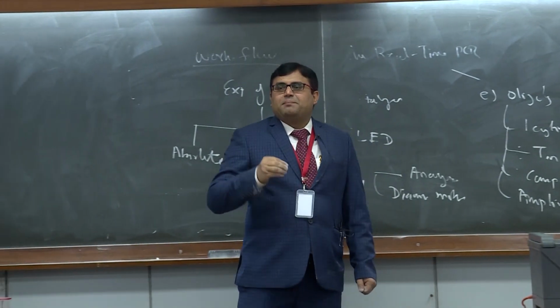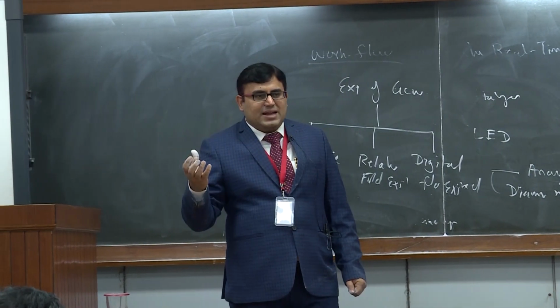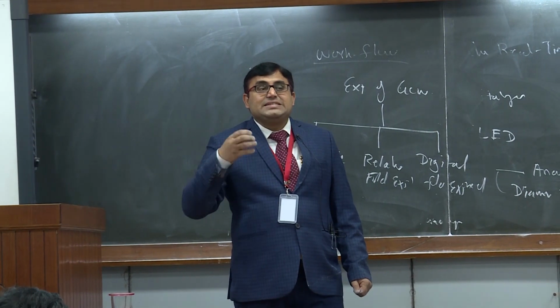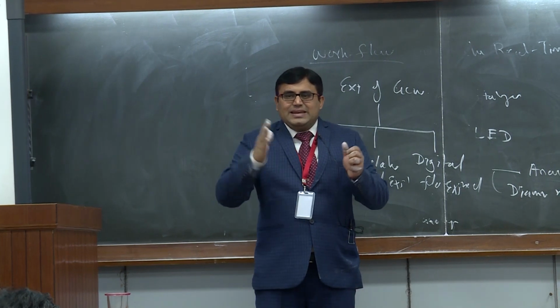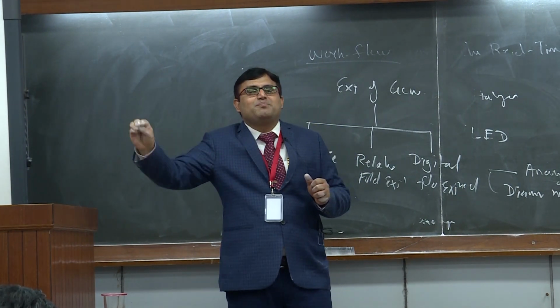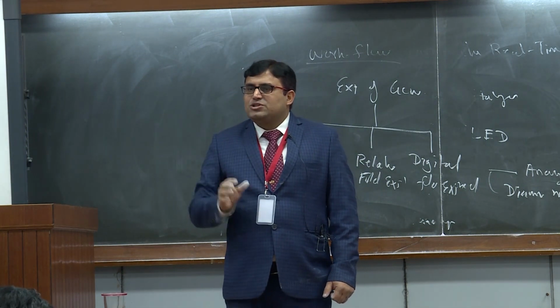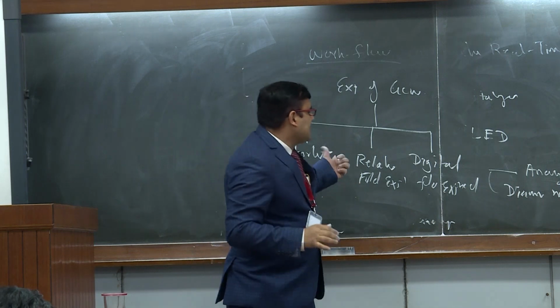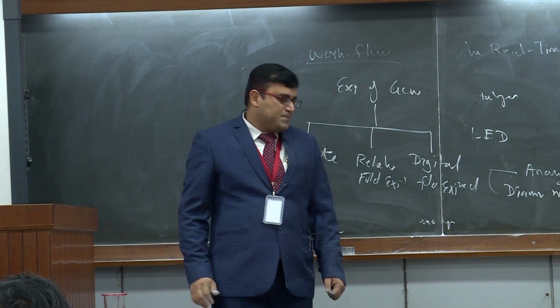Digital means by instrument read, the reads of the instrument that we have analyzed, which have been created digitally, and then we have counted the number of transcripts, and in a mixture of transcripts, a specific gene has this many transcripts. That is the digital fold expression. So expression has been broadly classified into these three different types, right?